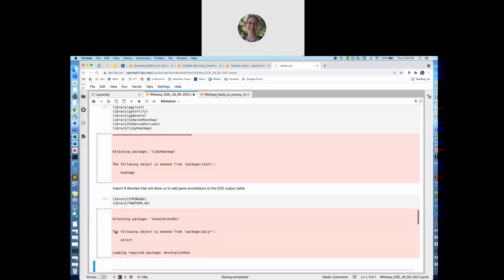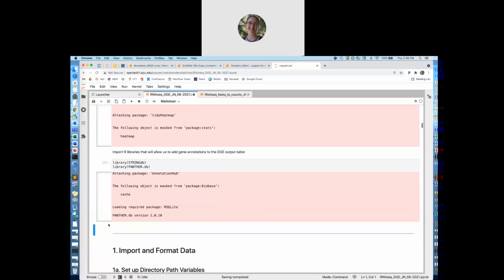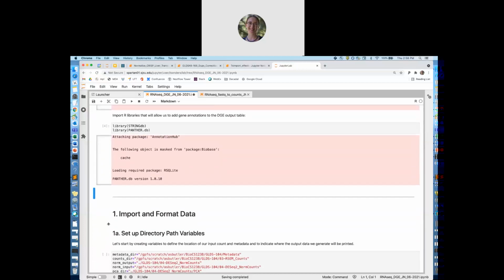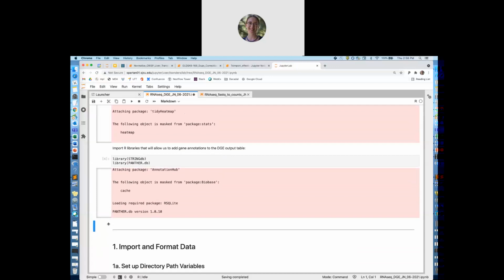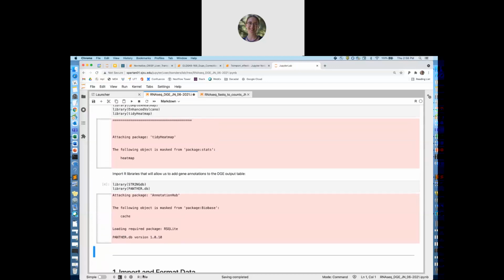All right. Did anyone get anything different from what I got here? Any weird errors? Any of these cells not able to run? Okay, excellent. So having imported, my cells don't seem to run. Okay, Veronica and everyone else, does it say R idle here, down at the left-hand corner?